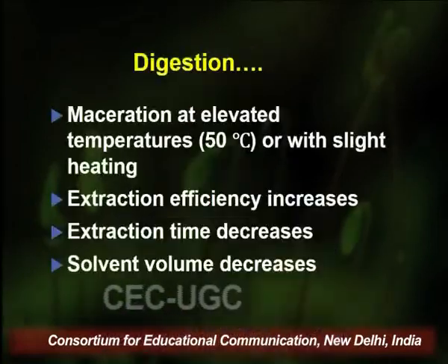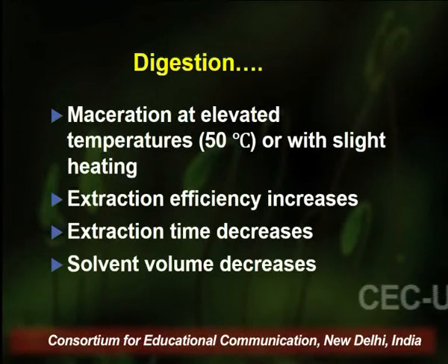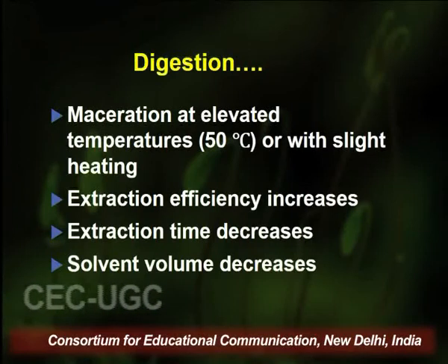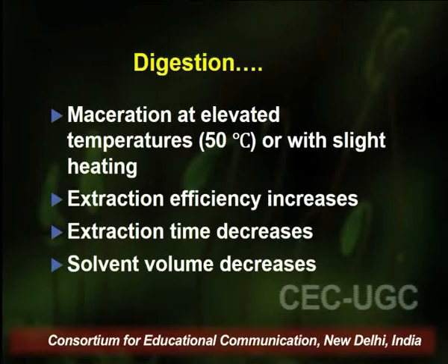Now this is nothing but maceration at an elevated temperature, and this temperature is normally kept below the boiling point of the solvent that is being used for the extraction. So slightly elevated, you can also consider this elevation above room temperature. And during this process also you can provide certain agitation or shaking to the container to increase the overall extraction efficiency. Now what happens with this increased temperature?